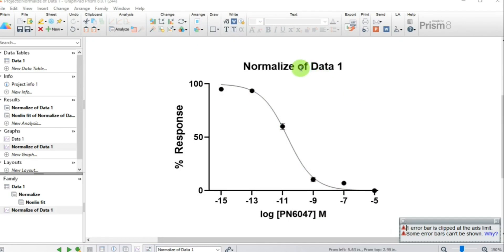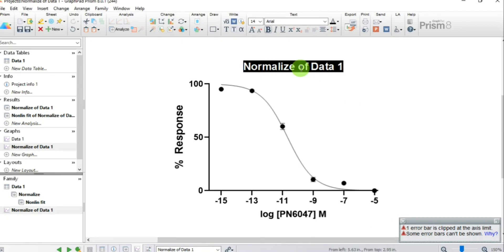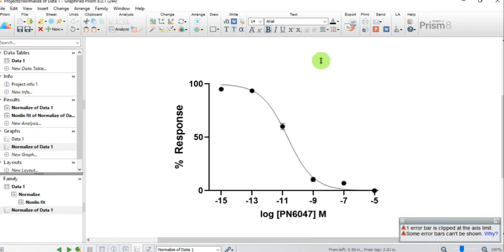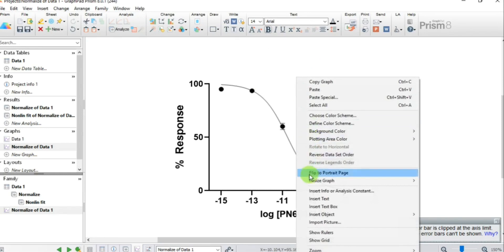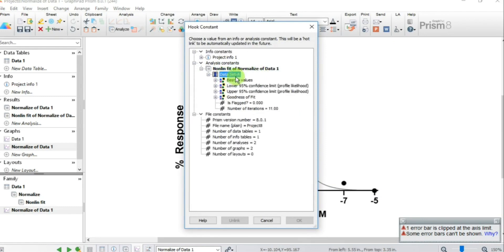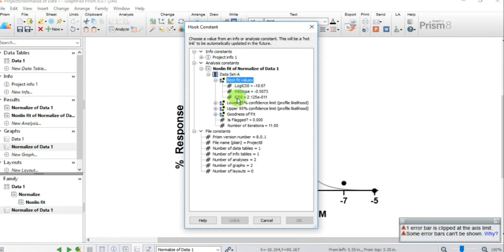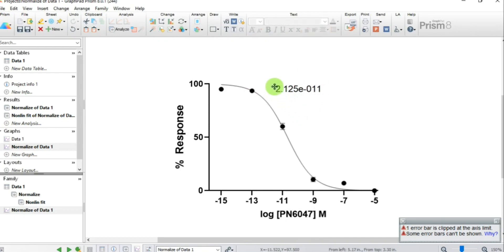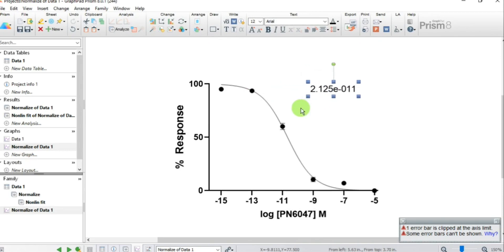I'll delete the "Normalize of Data" label from the graph. Here's a cool Prism feature: you can insert your IC50 value directly onto the graph. Right-click, select Insert, then Insert Info or Analysis Constant. Choose Nonlinear Fit of Normalize of Data, Data Set A, Best Fit Values, then double-click IC50 — the value 2.12 appears directly on the graph.